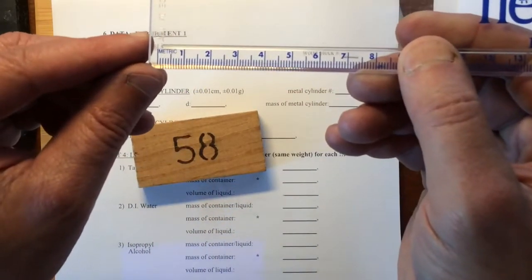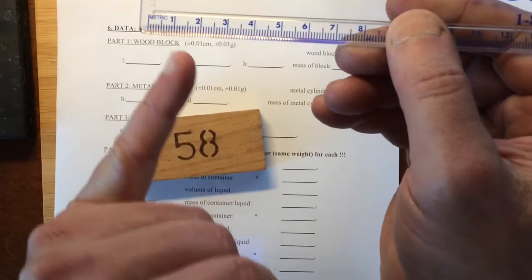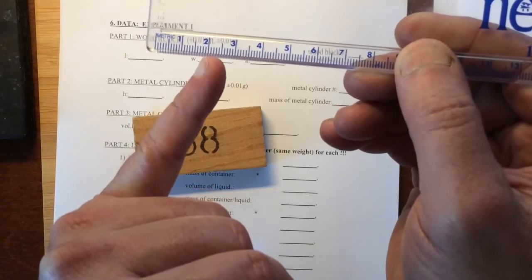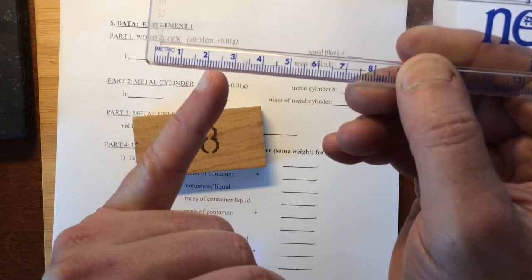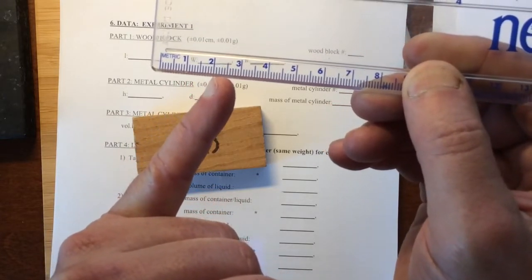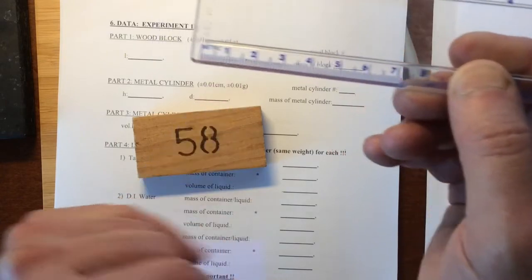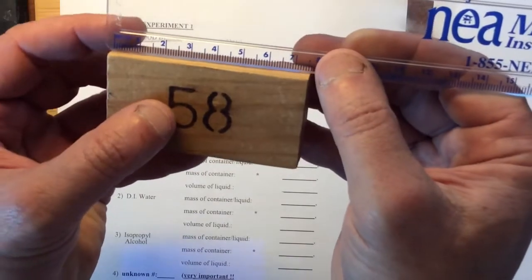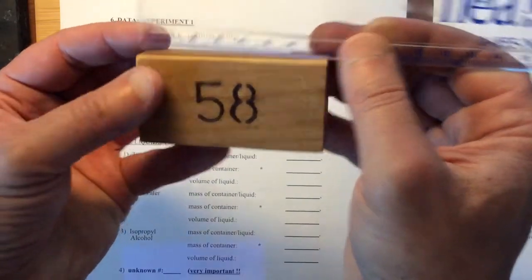If you'll notice on this, the numbered areas are one centimeter, two centimeter, etc. So the individual lines are going to be tenths of centimeters, and we're supposed to read to one tenth of one of those divisions. We're going to have to estimate what that last place is.